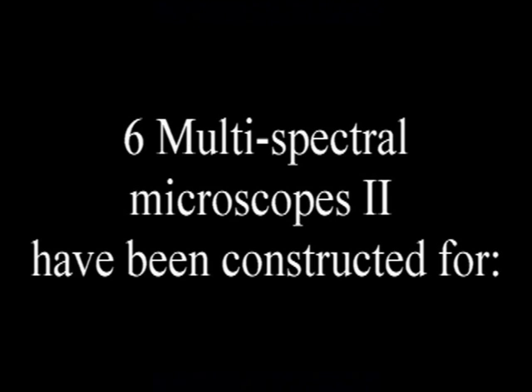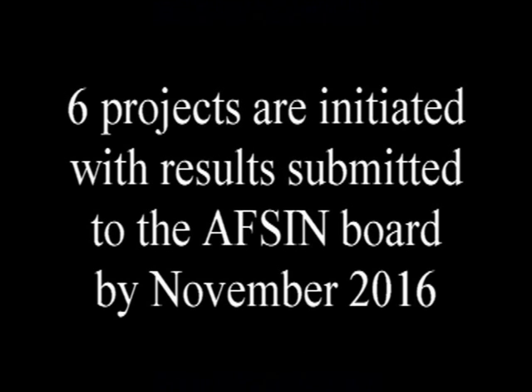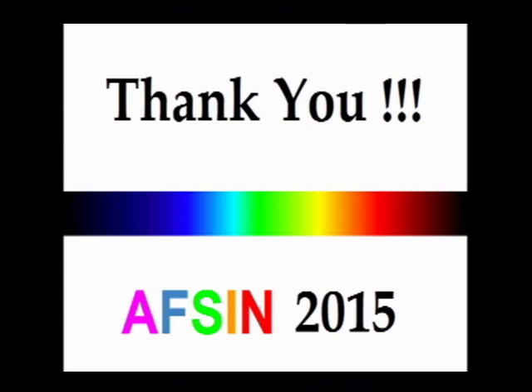6 multispectral microscopes have been constructed for Ivory Coast, Kenya, Burkina Faso, Ghana, Mali, and Senegal. 6 projects are initiated with results submitted to the AFSIN board by November 2016. Then a minimum of 1 research journal publication per microscope is expected by the next AFSIN workshop in 2017. So with that, I would like to thank you for your attention.